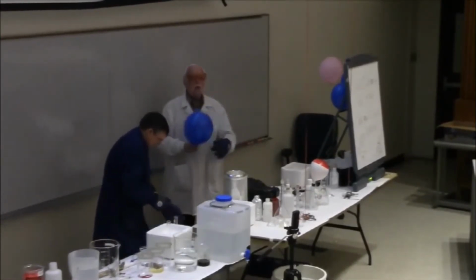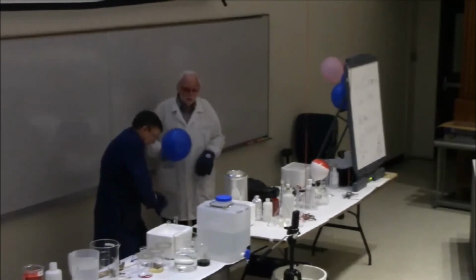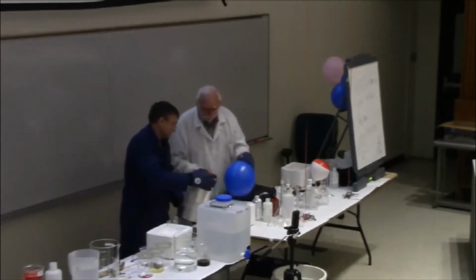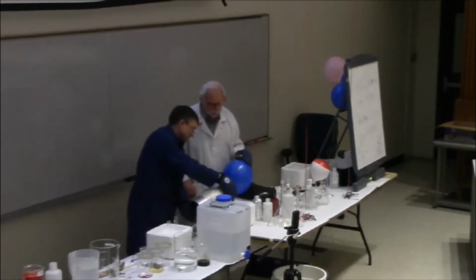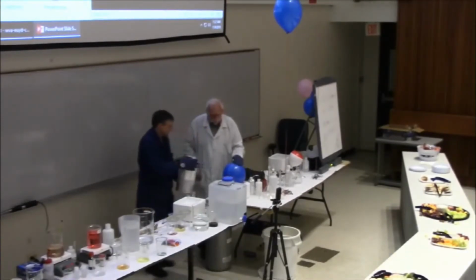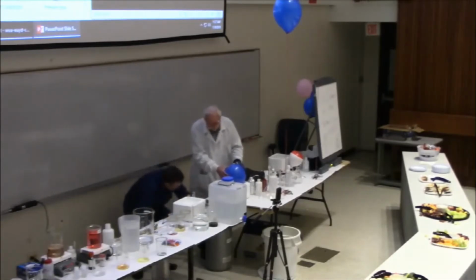This experiment also proves why if you're a chemist or a scientist, you also need to be a little bit of a lawyer. You have to be careful what you say. You have to pour some more in the cup.